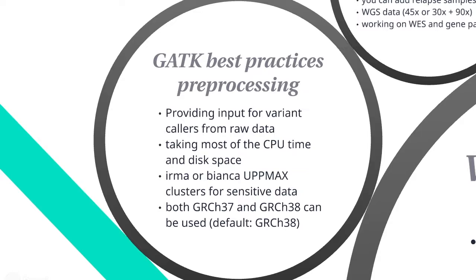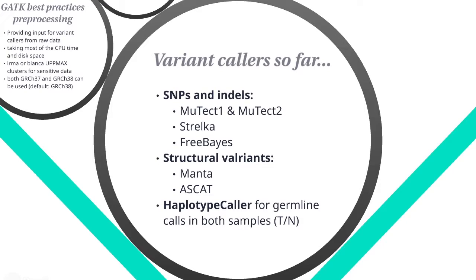We can use the old GRCh37 reference, but right now you can use the 38 as well. That is the latest human reference. And instead of using a single variant caller, we are applying a set of variant callers for SNPs and indels, and also for structural variants.